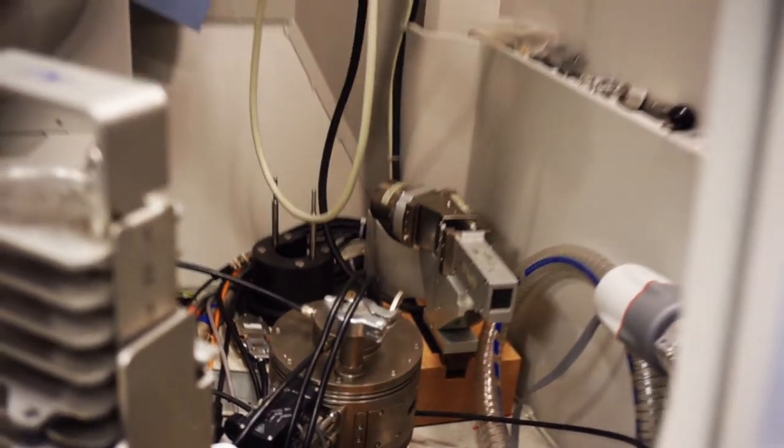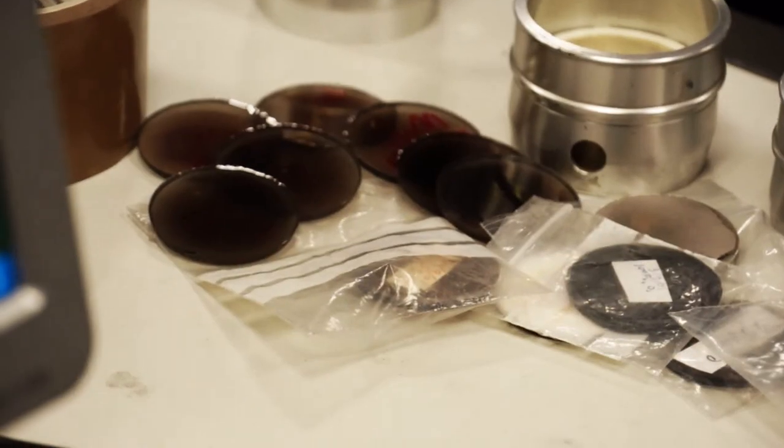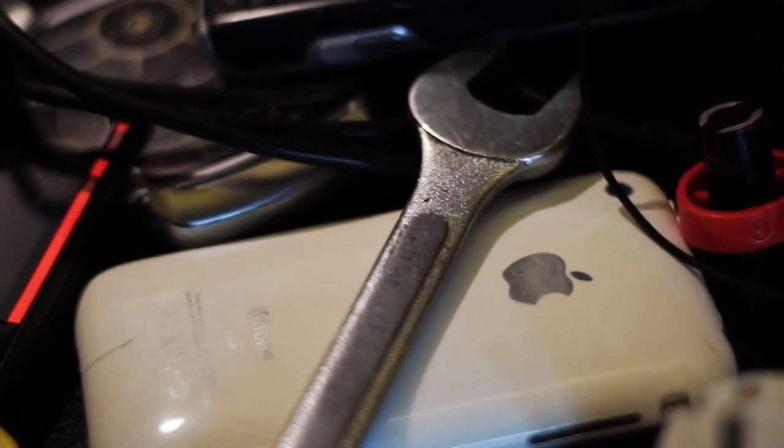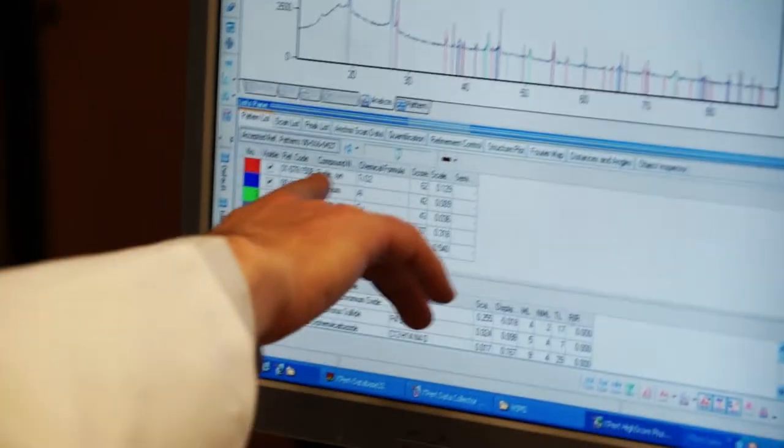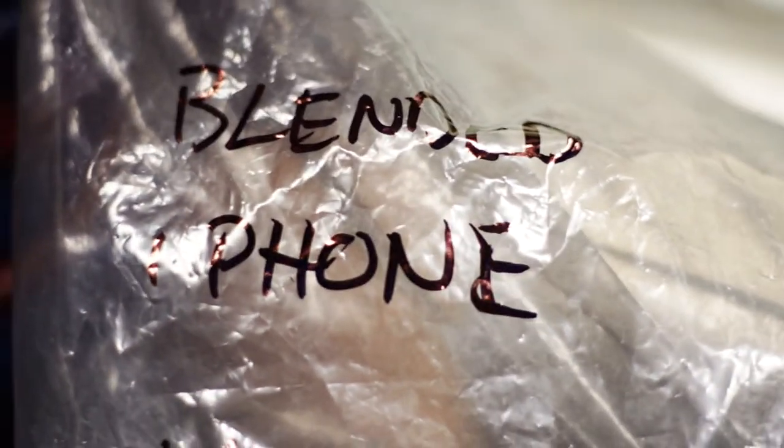So this technique, X-ray diffraction, is what we use when we try and identify what the compounds are, the crystalline compounds are, in a material. And in this instance we have been looking at a blended iPhone, which we put in a food blender so we made it nice and homogeneous and all crushed up.